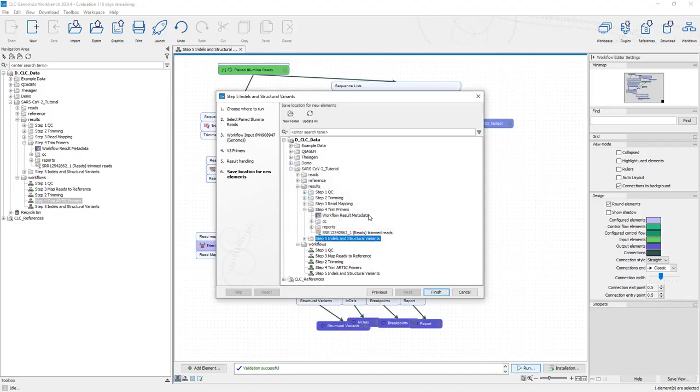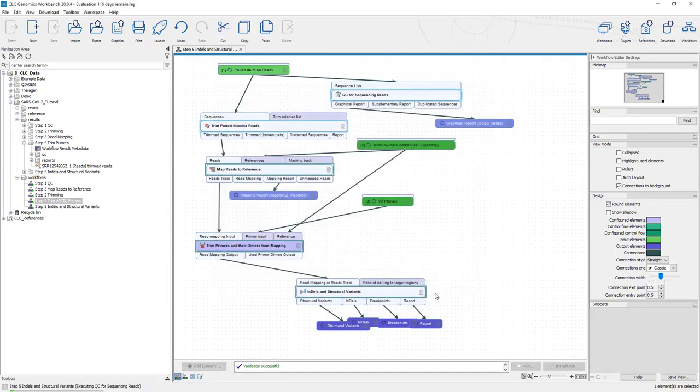And what I'm going to do from this stage on out in these tutorials is, each one of these workflows is going to take longer and longer. So I'll pause the video while it's running and then just pick up when it's done. So here I'm going to say finish, and it has started running, and I'm going to pause and we'll pick up when it's done.